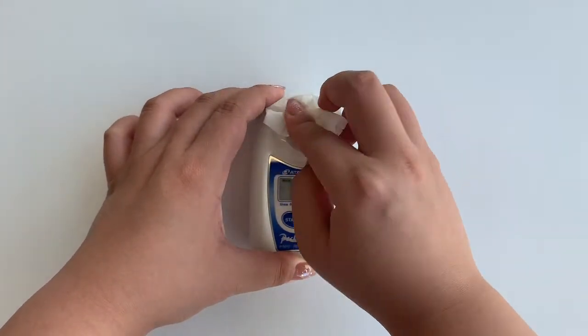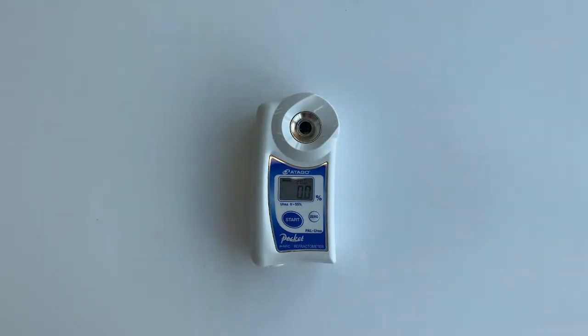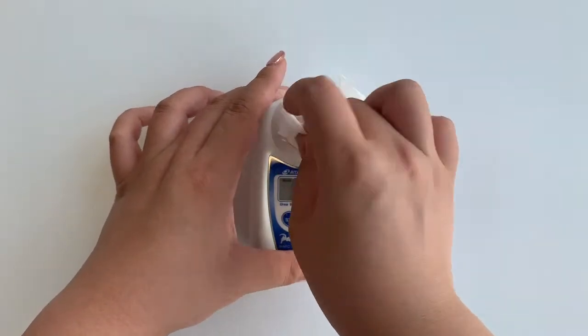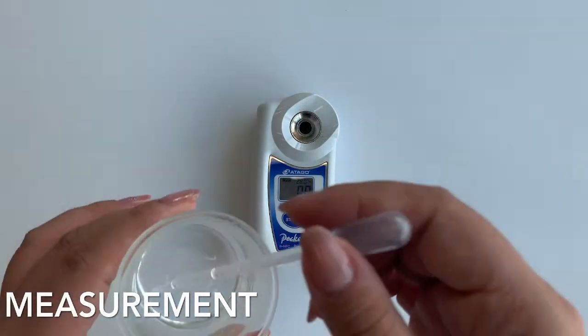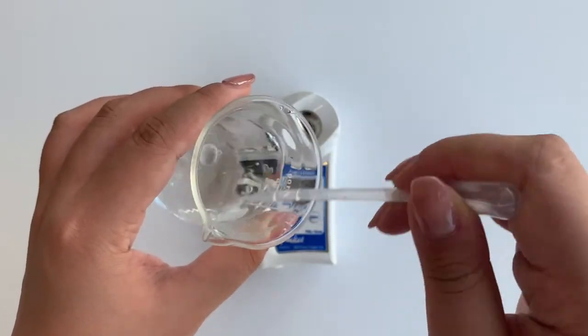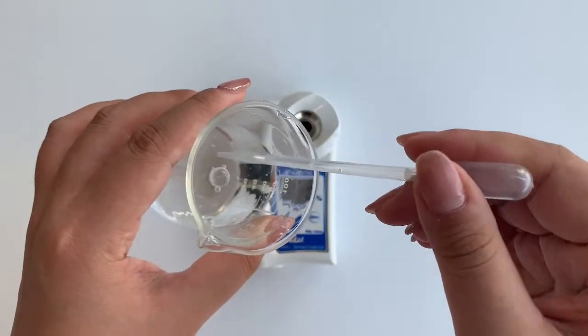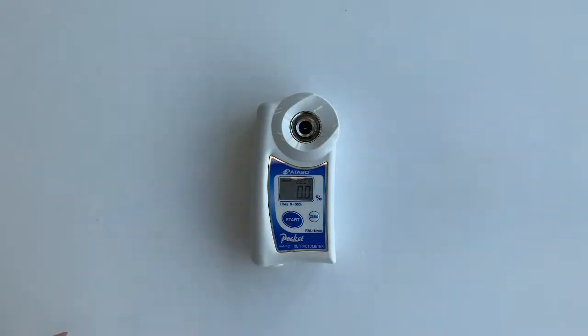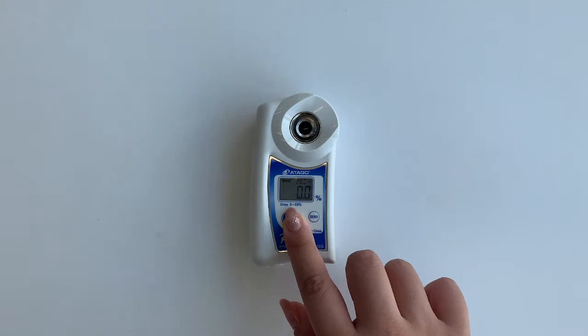After it shows 0, now let's do the actual measurement. But before doing the measurement, make sure to wipe the water off the sample stage. You don't want to leave any water because it will change the result. For the measurement, let's mix the sample, and after mixing it, put some on the sample stage and take several measurements to make sure that the result is stable.